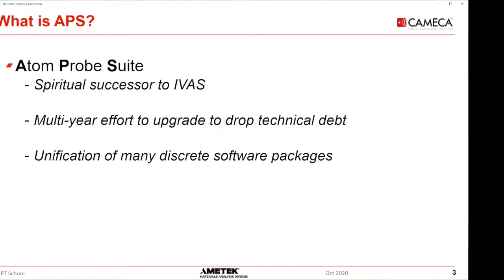APS is what we call it internally. It's Atom Probe Suite. It's really the successor to IVAS, and what we're doing is we spent probably 4 years now basically starting over.